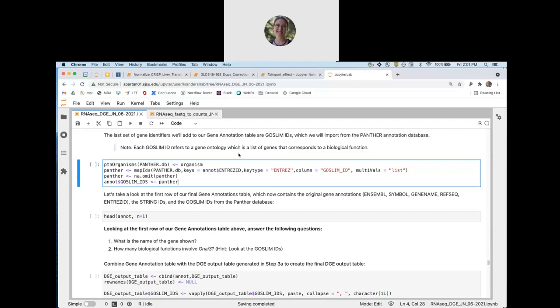So they did one of these assays and published those data, and then that went into the STRING database. So it's kind of a one-off, we're getting these data from multiple different places. That's why 28% of our genes aren't found in the STRING database, because someone just hasn't done that work yet, or the non-coding RNA situation.